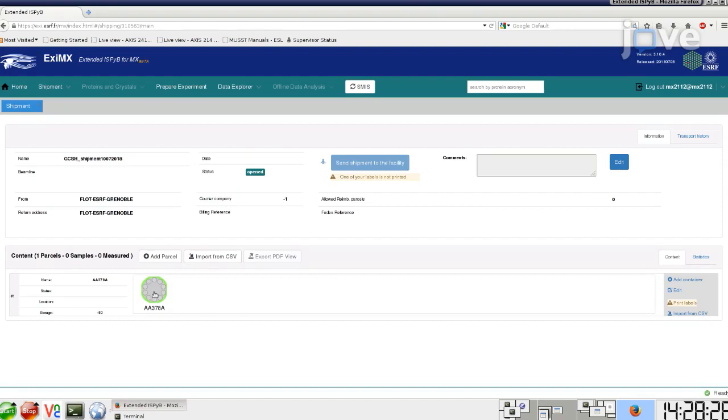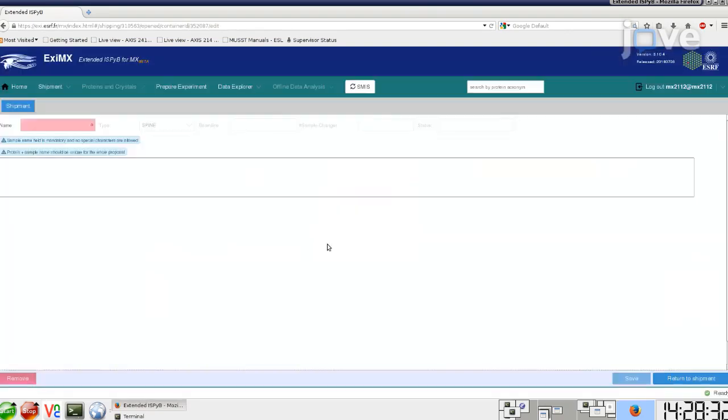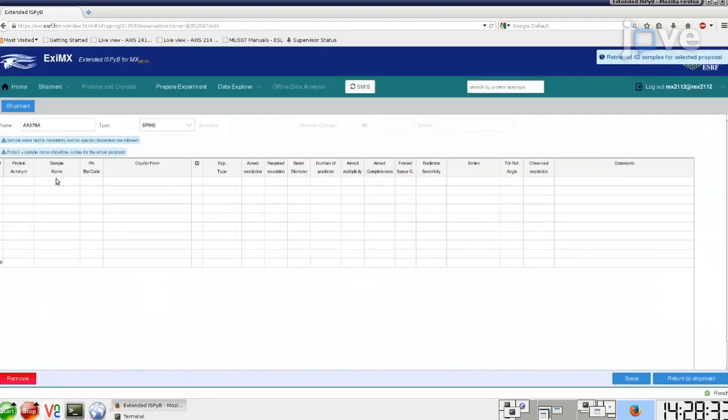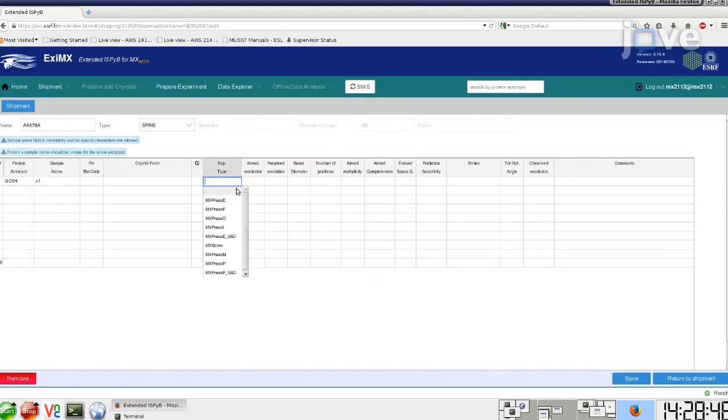Click on the container symbol and edit, and fill in the necessary information concerning the samples such as protein name, preferred workflow, and crystal position in the puck.